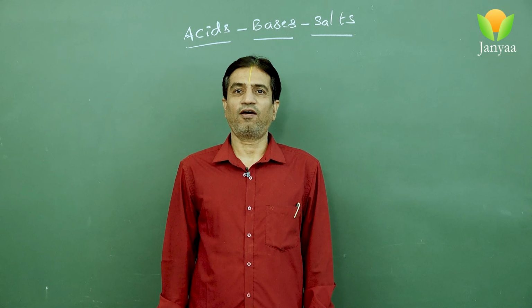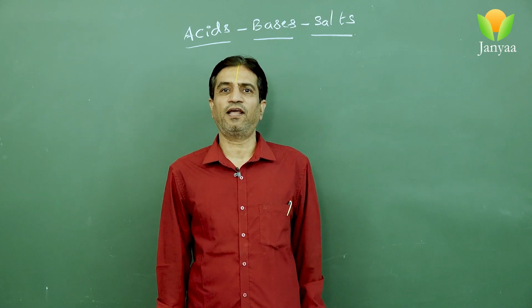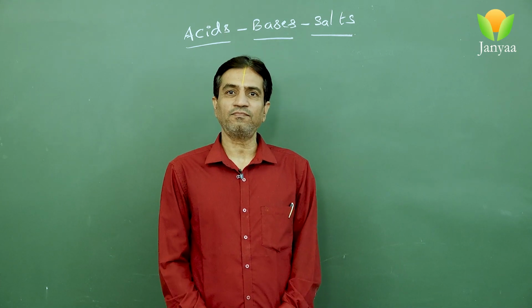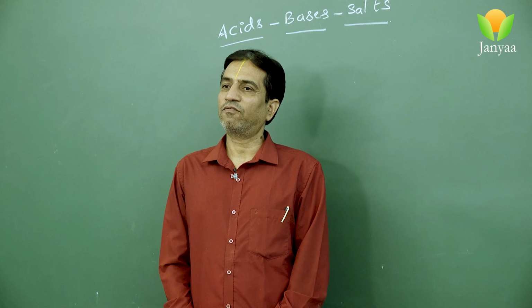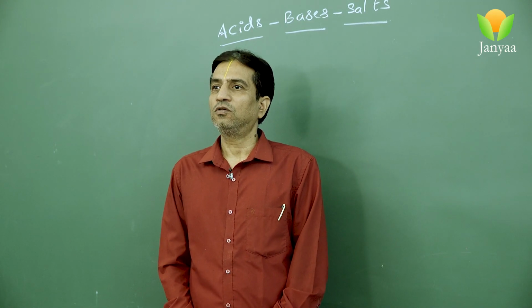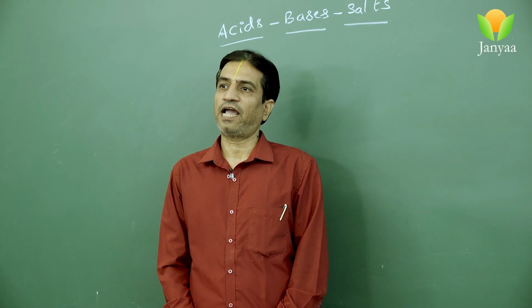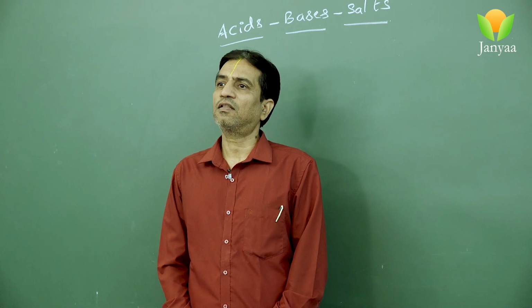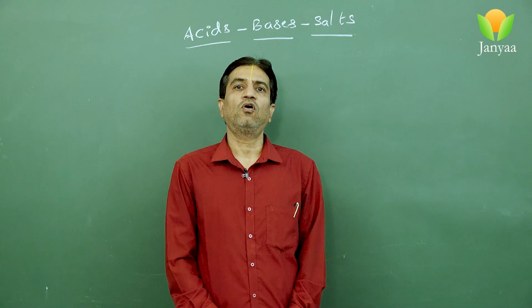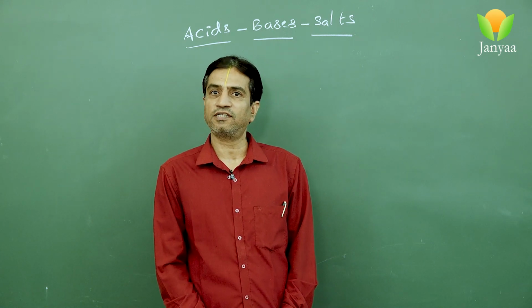Hi, one and all. In day to day life we take so many food materials, and all the food materials come from nature. At our school as well as at our home there are so many soils, some sandy, some otherwise. In all the soils the plants will grow in good condition and the yielding will be good. How can you test all these things?